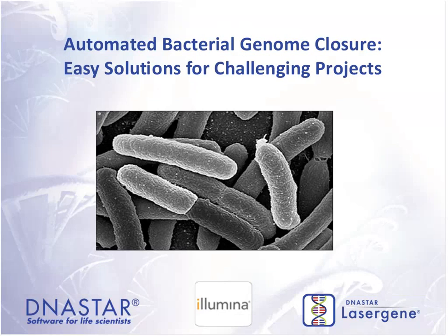I'd like to go through another project that's unique to our software. It's the automated bacterial genome closure, and we like to call this an easy solution for what really can be a difficult project. I've worked with many, many customers who have sequenced microbial genomes. The de novo assembly is fairly straightforward, but it's the gap closure, the finishing of the genome, that can be very, very difficult, especially for people that are new to genome closure.